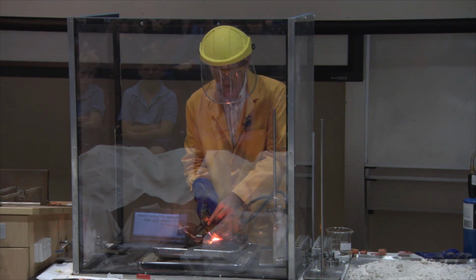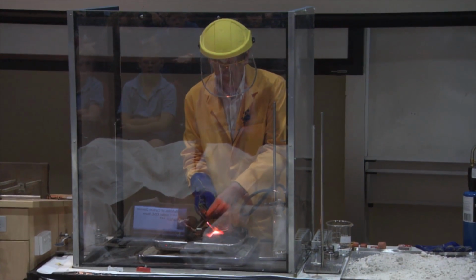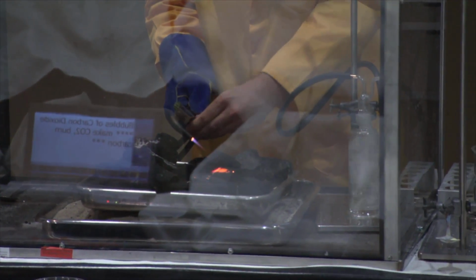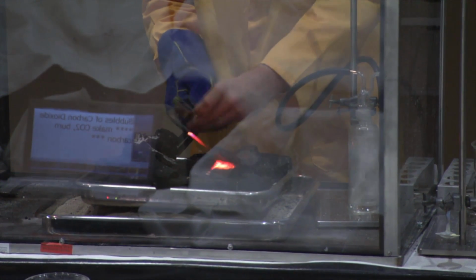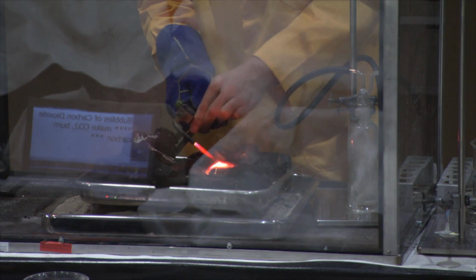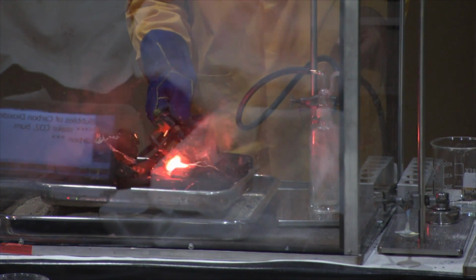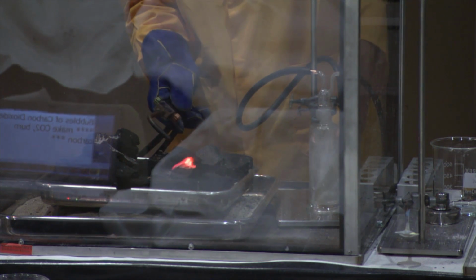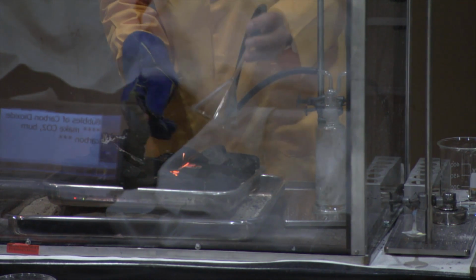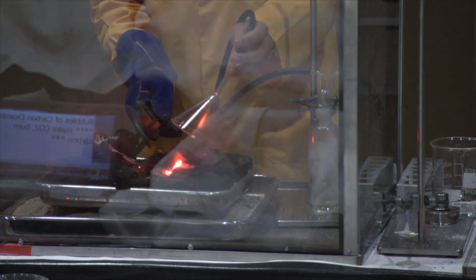I'm going to turn the fuel off, and we're just going to use the oxygen to keep it going. I hope. Aha, there we are. So now there's no flame coming out the front here, it's just oxygen. So that's going to help keep my charcoal burning nicely. But at the moment, our lime water is completely colourless. But I'm now going to draw some of the gases that are coming off of the burning charcoal through our bubbler, and keep an eye on the liquid in the bubbler.